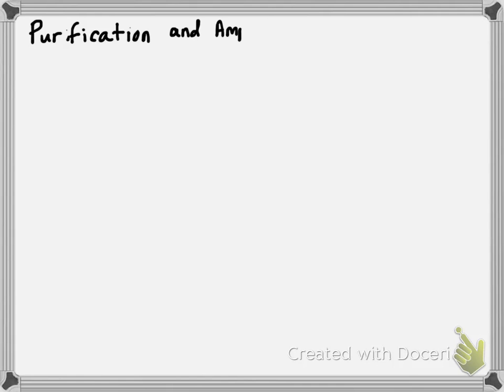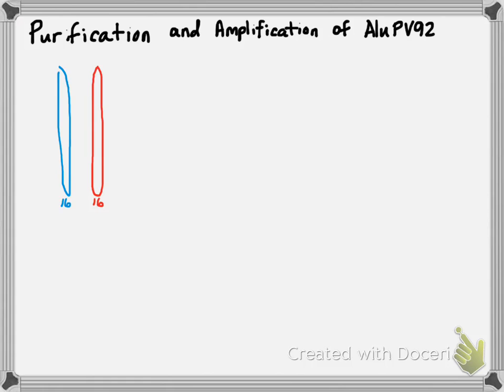Welcome. This animation is meant to prepare you for the first day of the laboratory in which we purify and amplify a non-coding portion of your 16th chromosome. The first day is the purification of your own DNA from your cheek cells. The second day we will use a device called a thermal cycler to run the polymerase chain reaction and generate many copies of the portion of DNA we're studying. If we don't get it right today, the remaining days are an exercise in futility.